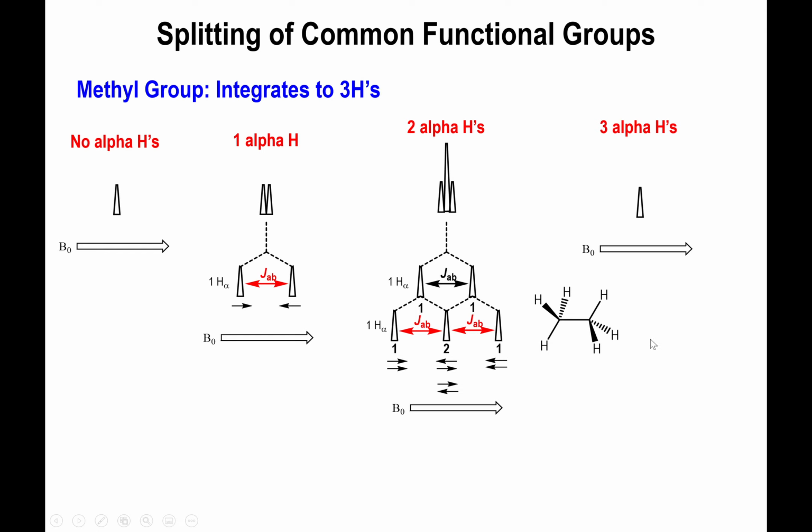And what this emphasizes is that you have to be very much on point looking for those symmetry elements in your molecule, because if there are symmetry elements and you fail to account for them, you're going to end up predicting more peaks than there should be. You're going to start looking at the spectrum and not realize what's going on. So do pay attention to the symmetry. Don't just go into autopilot mode and say, oh, I have 3 hydrogens next door, I'm going to have a quartet. That may be true for some cases. In this specific case, that will not be true at all. So yeah, that symmetry plane will do you in if you don't consider it.